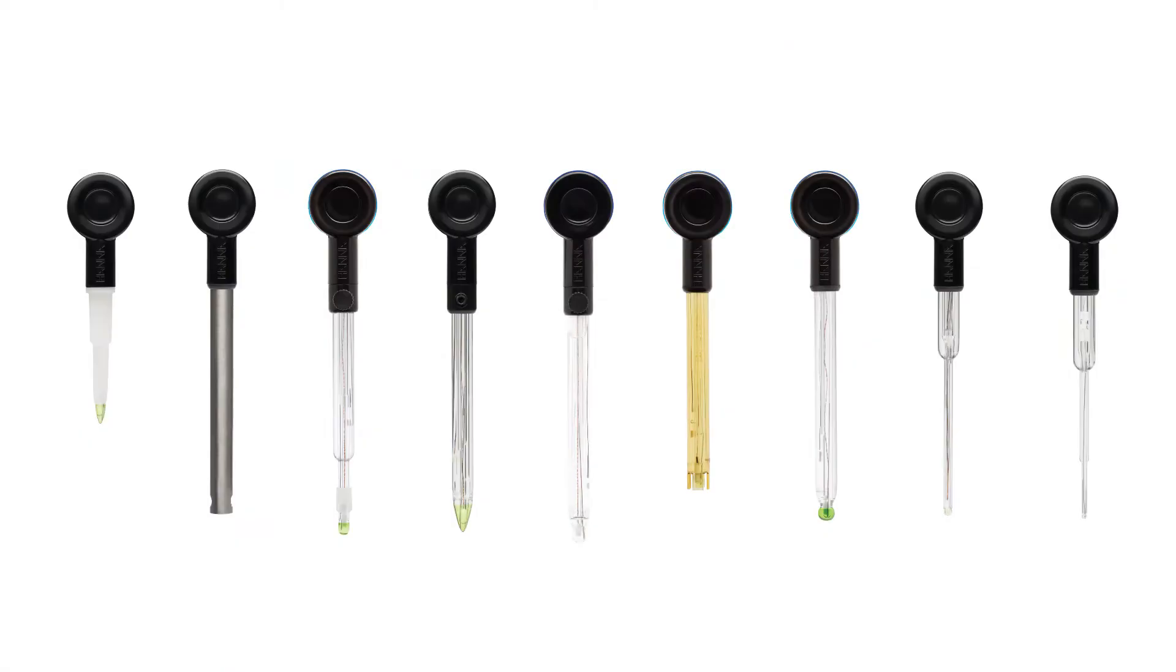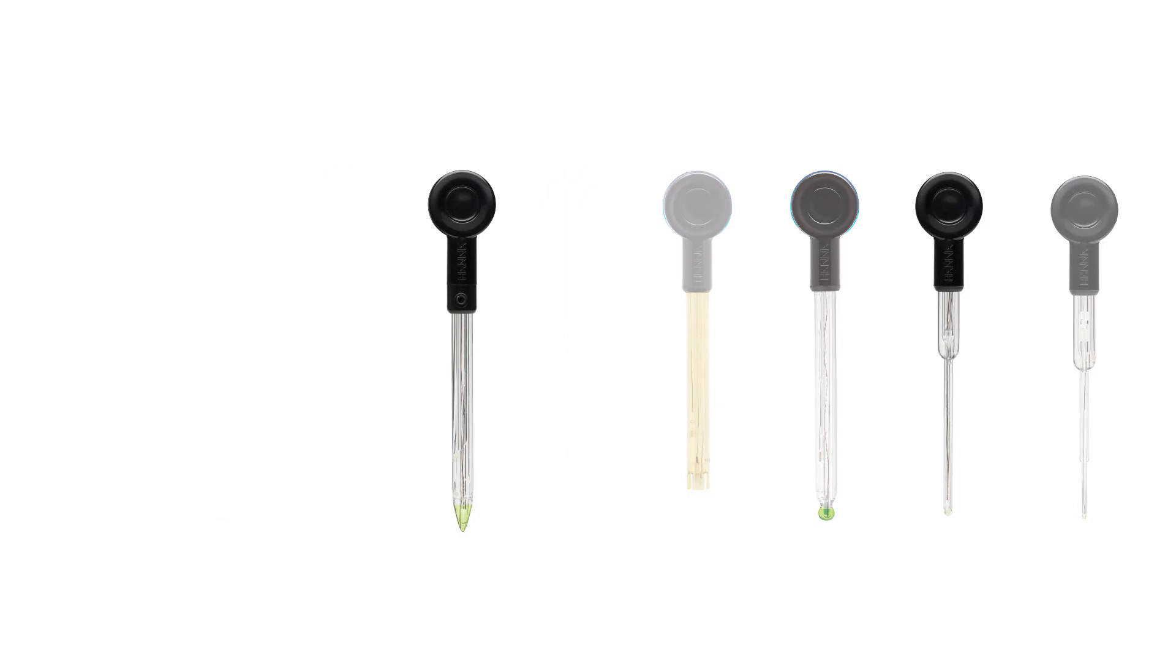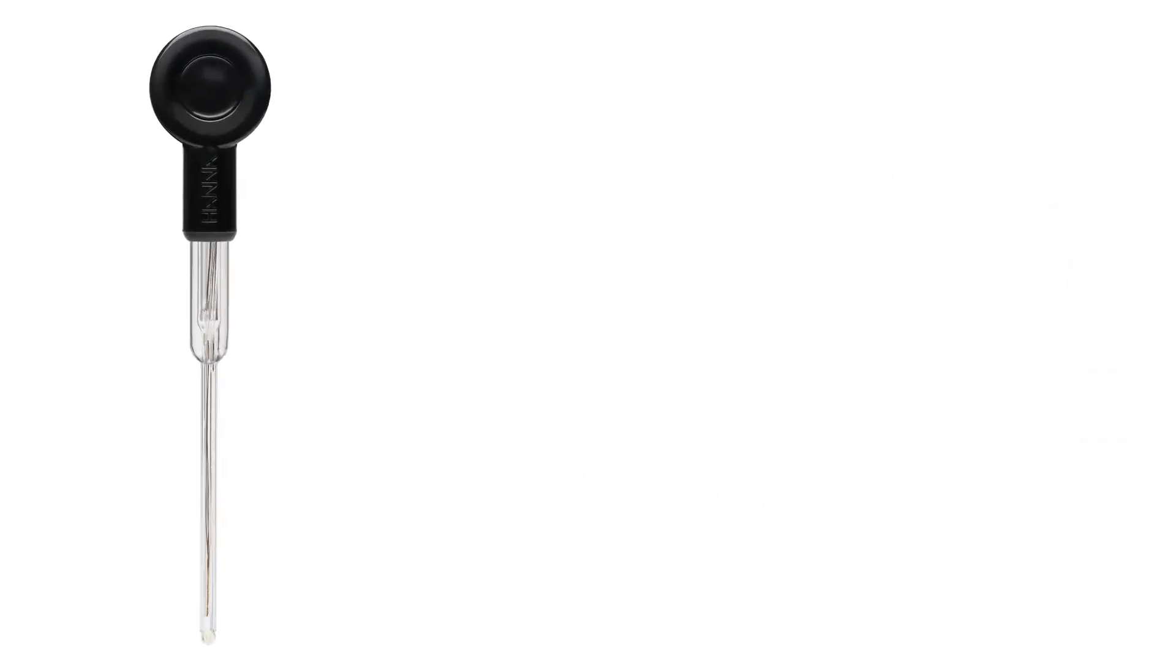Designed for industry professionals and hobbyists, the Halo wireless pH meter line meets your needs. Let's take a look at the HI13302 Halo designed for measuring the pH of small samples.